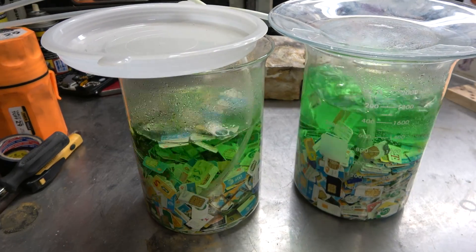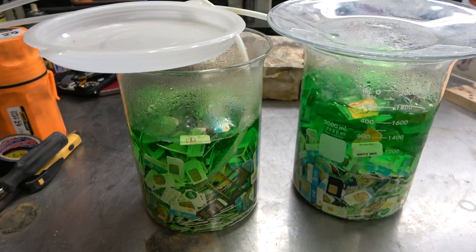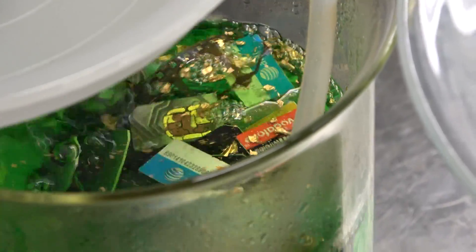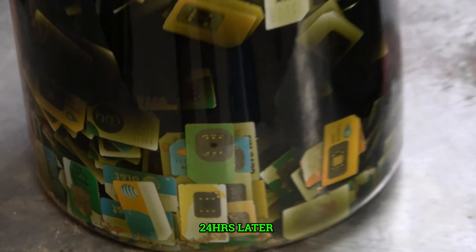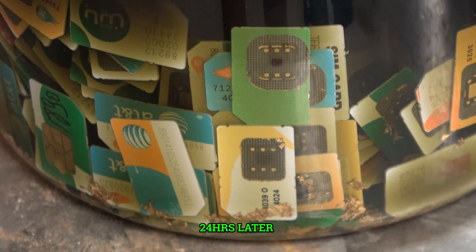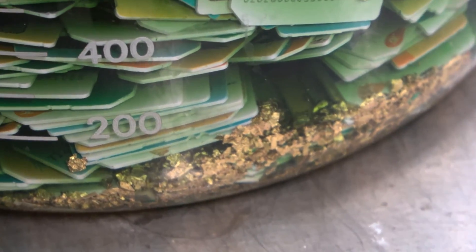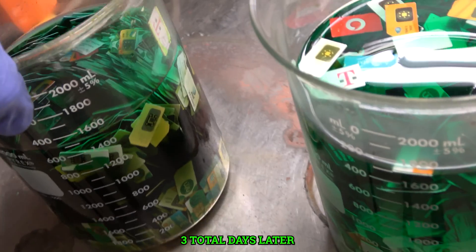You're going to leave it like this for about two or three days. Sometimes if you have a little bit less it doesn't take as long - it really depends on the cards. I've had some cards where this process takes a week. Here's 24 hours later - you can see most of the foils are dissolved, though there's still a little bit left. The gold foil stays at the bottom and the solution starts to turn a very dark green or black color. At three days in, you can see the gold foil sitting at the bottom.